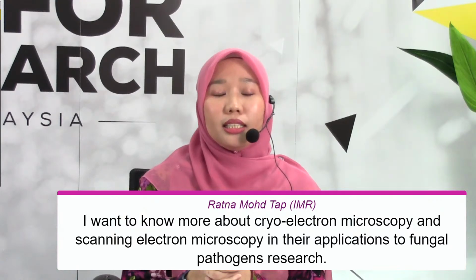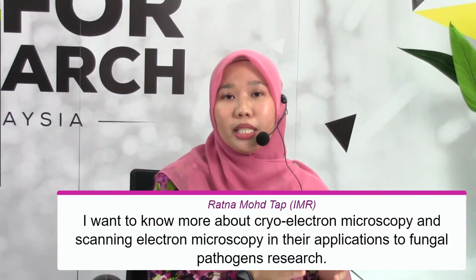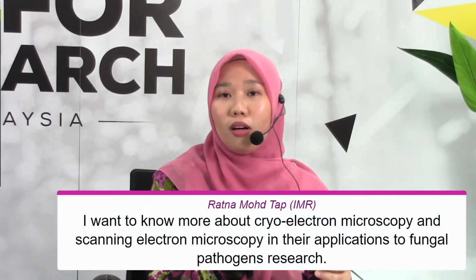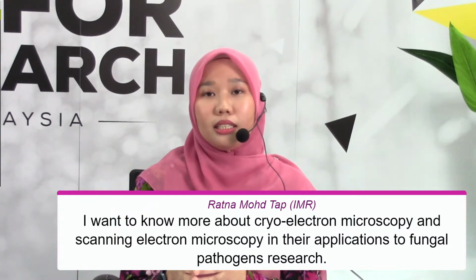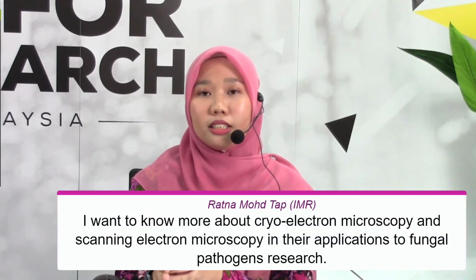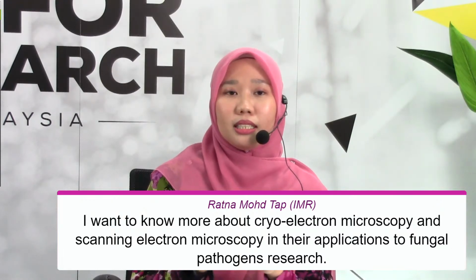But then in cryo-electron microscopy, from the sample prep, initially at the beginning we have to be in cryo conditions. Even in the sample prep, all the fixation until dehydration, embedding, and also sectioning must be in cryo. Even for sectioning, we need another type of ultramicrotome, which is the cryo ultramicrotome. And for the electron microscope itself, we also need to have the cryo EM.